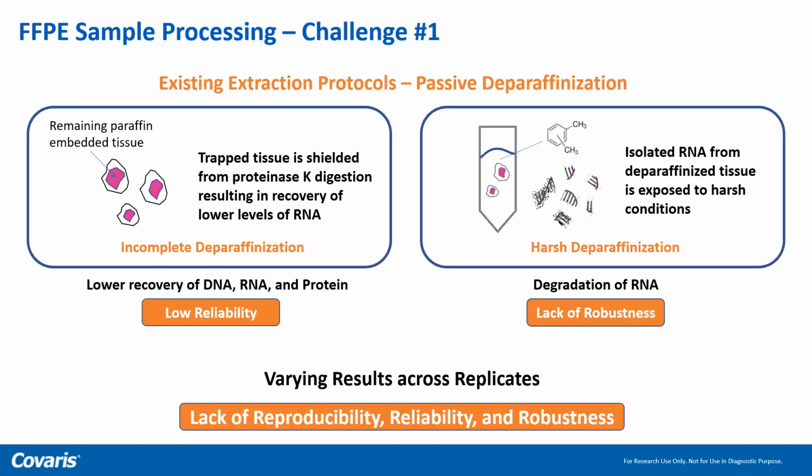The challenge lies in how do you get that tissue out of that wax block? Now imagine, this is not like frozen food that you can buy from the grocery store that's packed in ice, right? That ice will melt away. It's wax. It can go through hot, humid conditions without losing anything, right? So how do you remove that paraffin? How do you remove that wax?